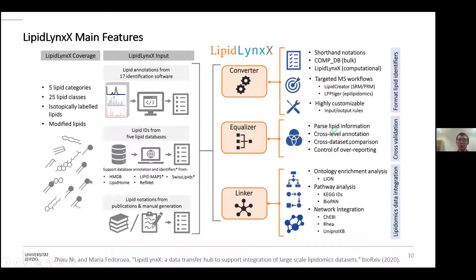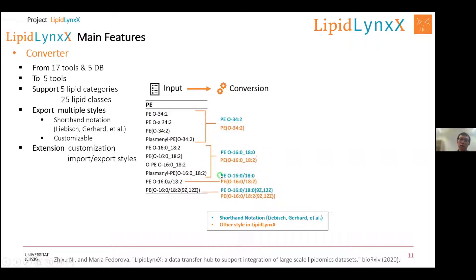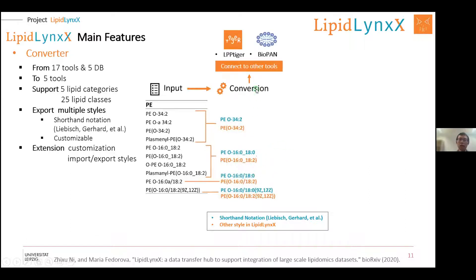The first module is the Converter. We collect different tools and databases and can export to five different styles. We collect different abbreviation styles from various tools and databases, and then convert them to the shorthand notation and other styles. You can then connect to other tools like LPPtiger or BioPAN.